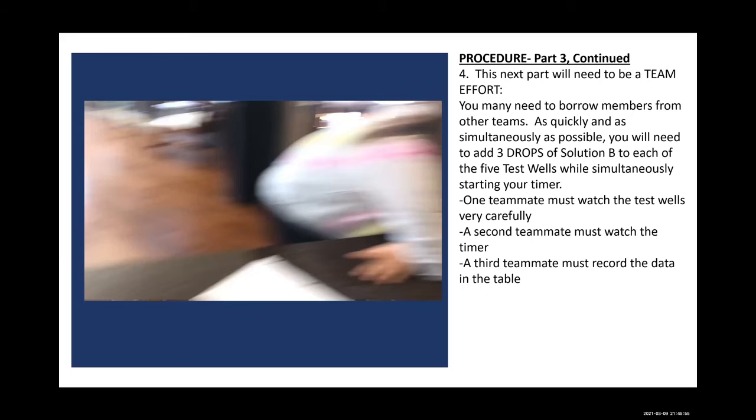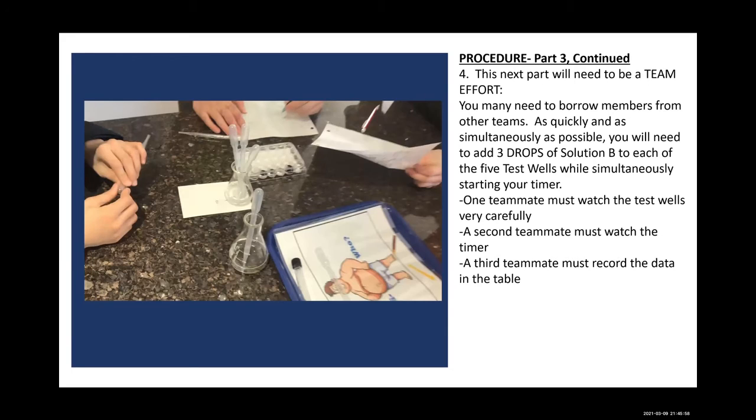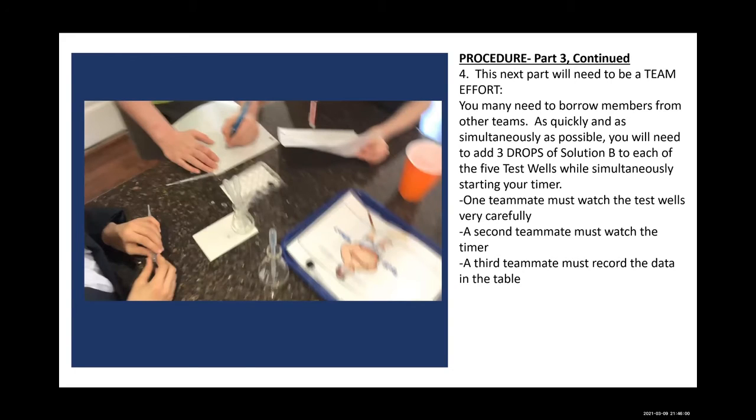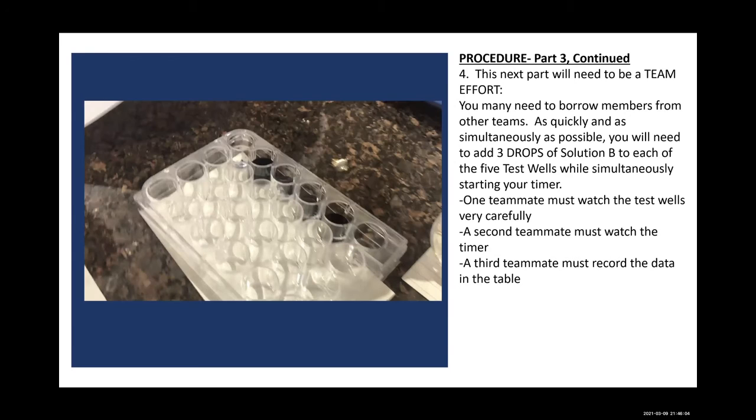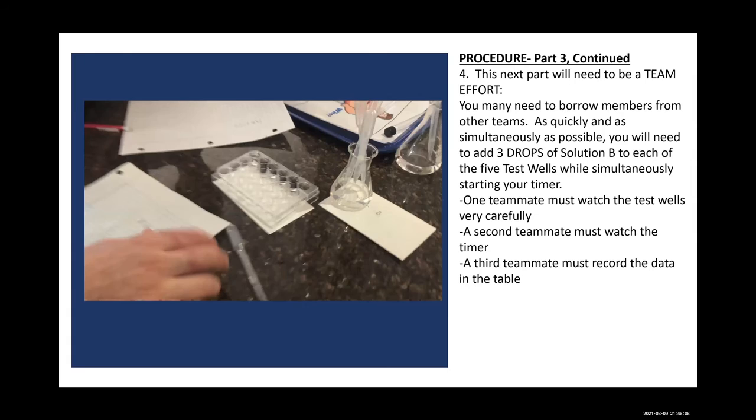Oh, whoa. Mine's like completely black. Nice. Look at that. Very nice. The main one's only black on the top, but this one's super black. This is the order in which they went. Cool. This is the times.